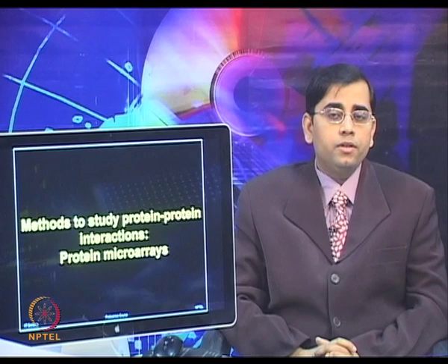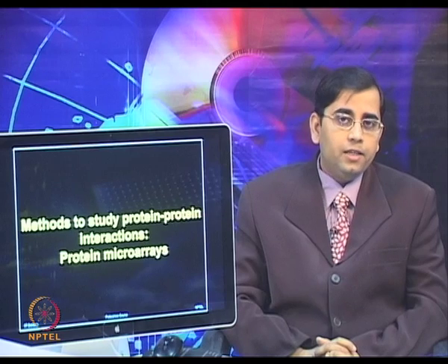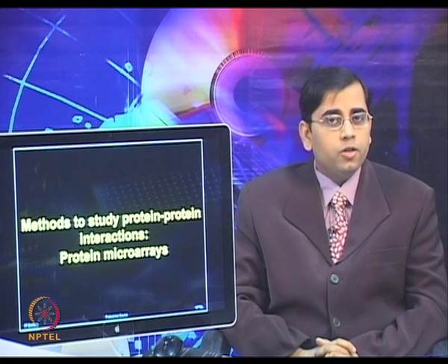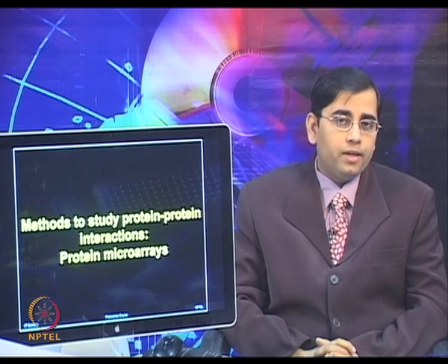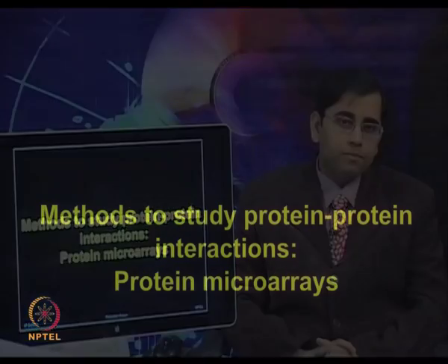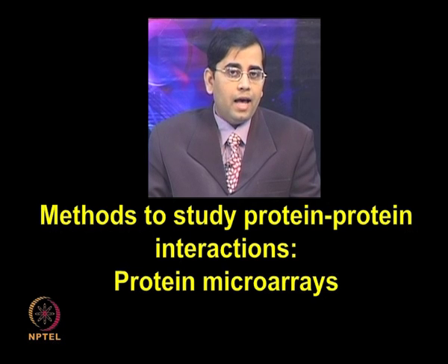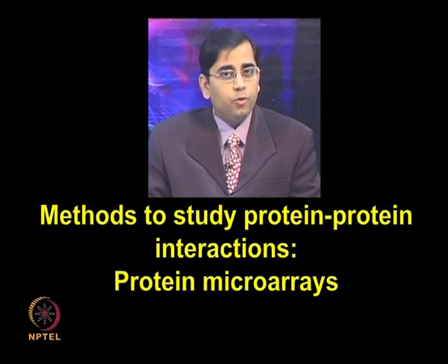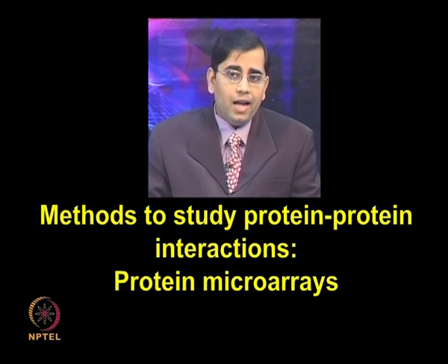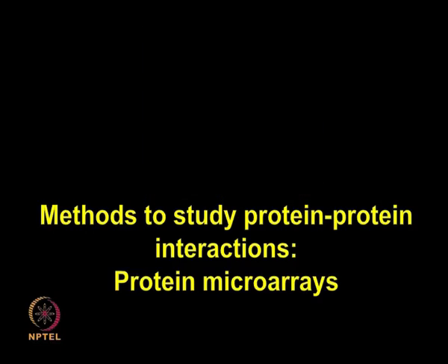After discussing different types of traditional methods which have been used for studying protein-protein interactions, now let us talk about some of the high throughput approaches which have also been used for studying protein interactions. Though many interactions are discovered by using yeast two-hybrid and immunoprecipitation studies, the reports of high false positive rate as well as the poor reproducibility of some of the earlier discussed methods have been a limitation.